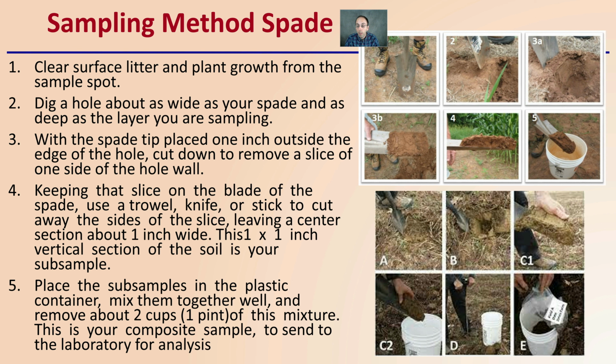So again, you could use a PVC pipe. I like the 1.5 inch because it comes out relatively easy. You're able to dislodge it much easier than if it was a smaller diameter pipe. But since we've got the official soil core here, it operates in the same method. So here's my sample area, and here are my corn plants or whatever. I put that here on the soil, and then I push that down to about that mark. I give it a little rotate, and when I pull this out, you're going to notice I've got my nice core right here.